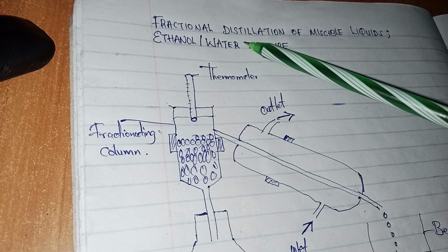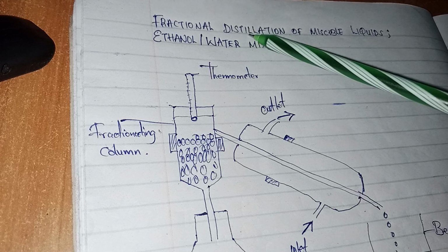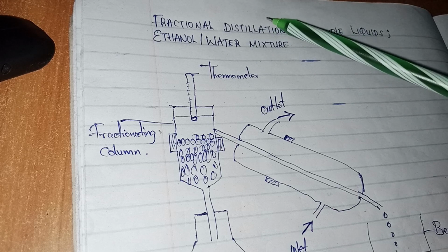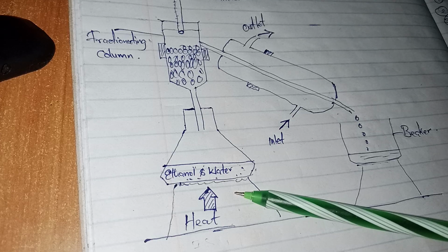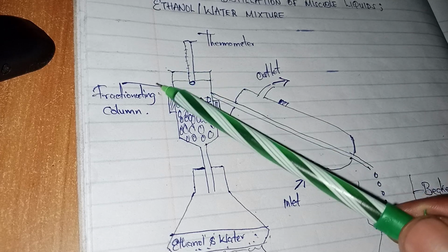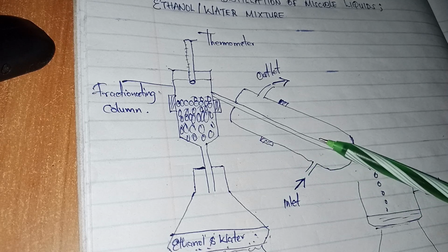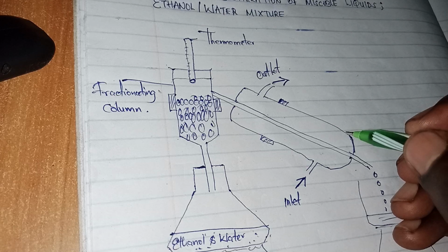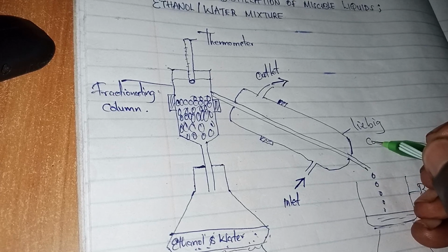And for this method of distillation, just to emphasize, distillation is just an improved method of evaporation. It is improved because we are going to use it just as evaporation, but the improvement comes because you're introducing the fractionating column, and instead of using the cold water bath, here we are introducing another thing we call the Liebig condenser.